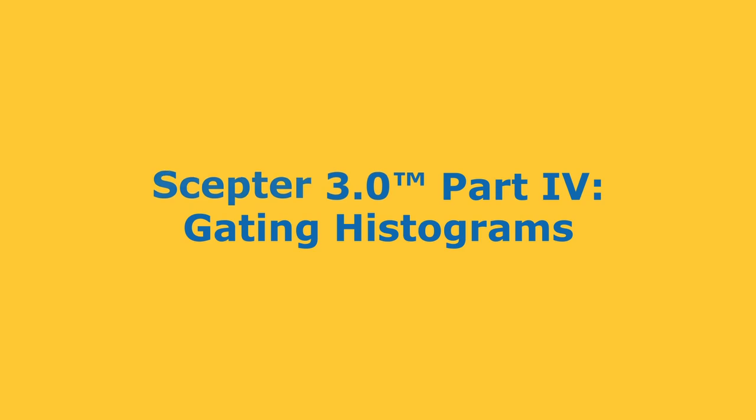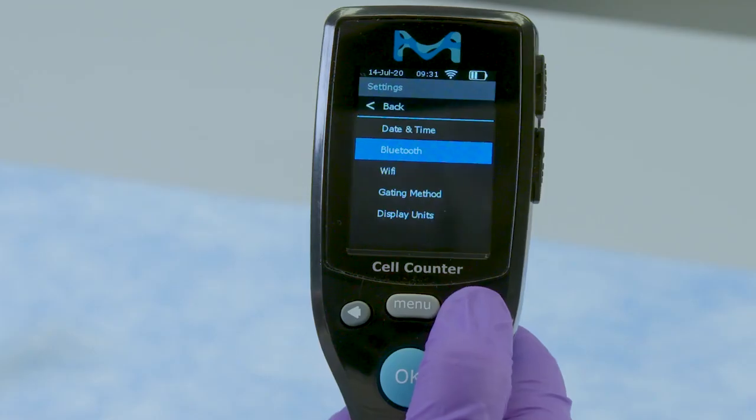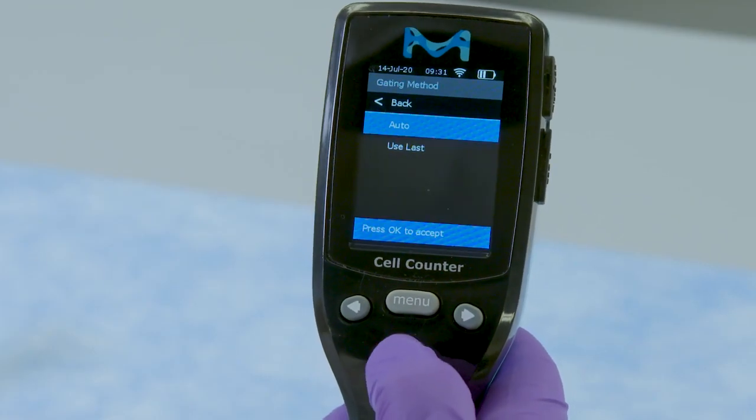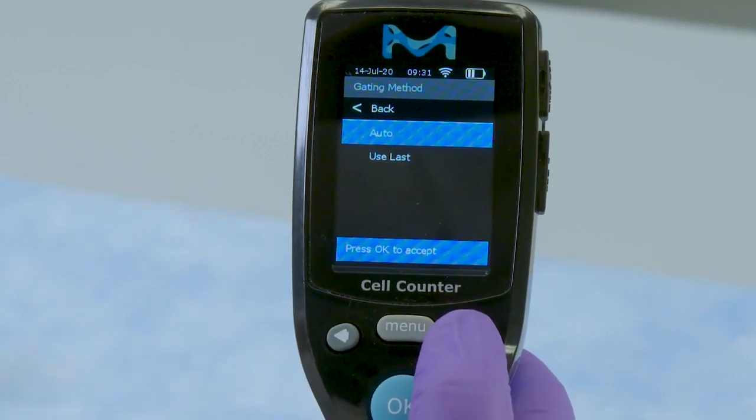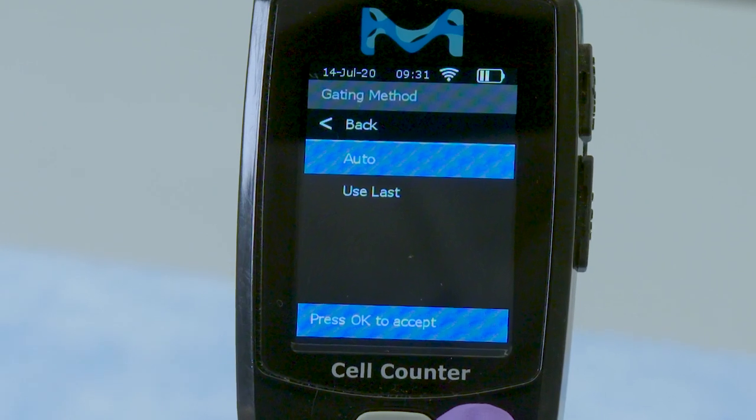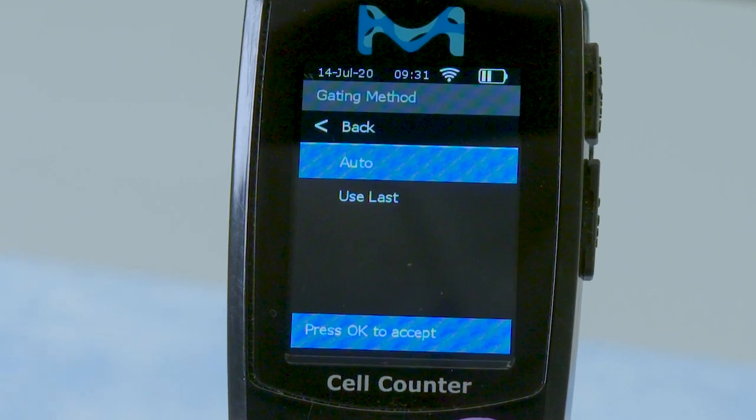Gating histograms with SEPTOR 3.0. For first-time usage set to auto gating, you can decide to continue with the gating using the auto gating setting or change to use last for similar sample runs.